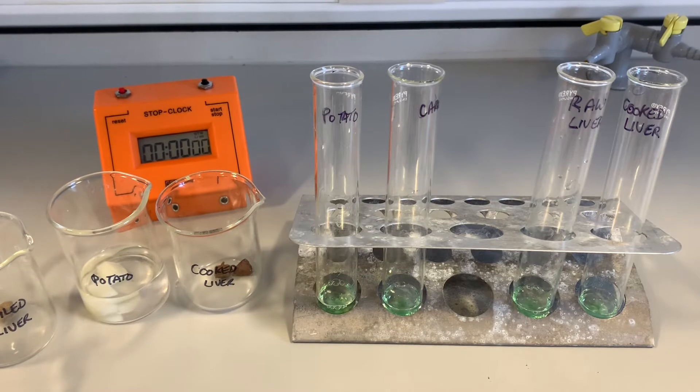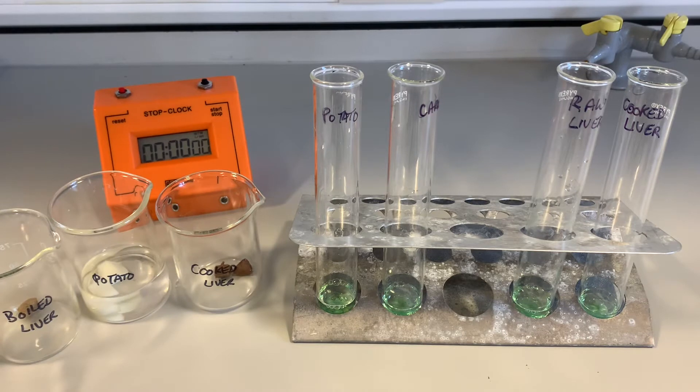One way of doing that is to relight a glowing splint, like we did when we used the manganese dioxide. But the other way is to add detergent to your hydrogen peroxide, because when the oxygen gas is formed it gets stuck in the detergent and it forms froth, which we can then measure. The more froth, the more the hydrogen peroxide has been broken down to produce the oxygen gas.